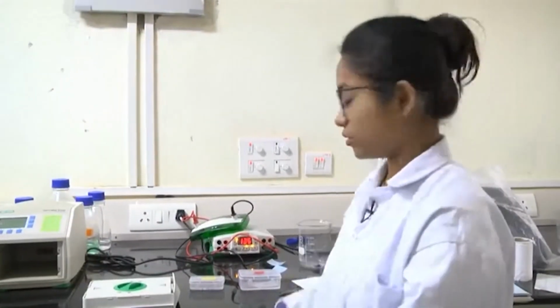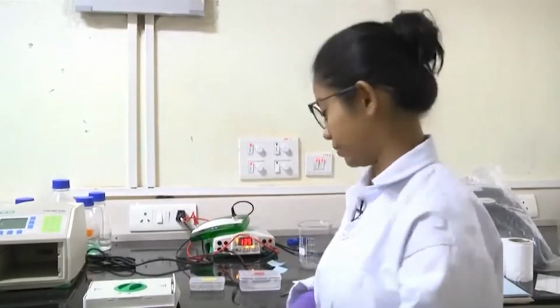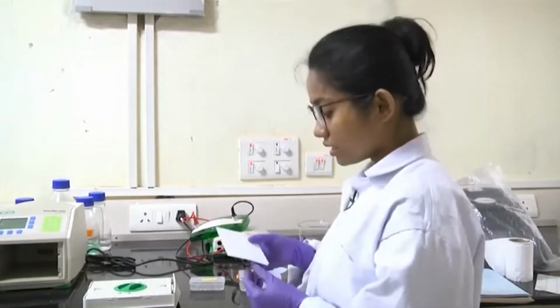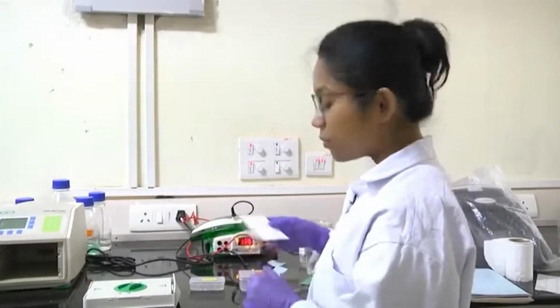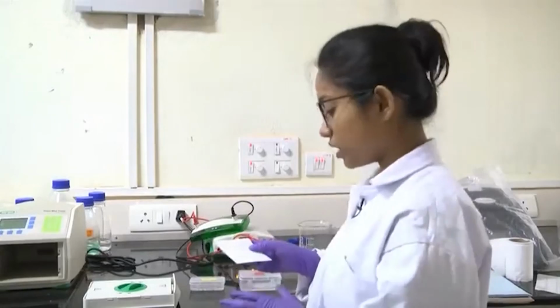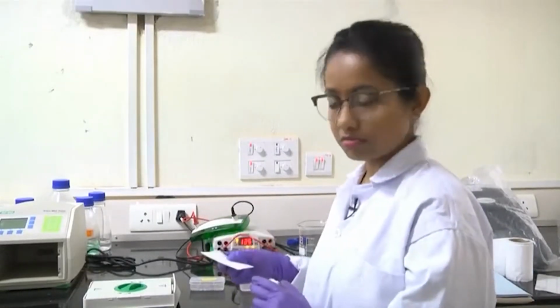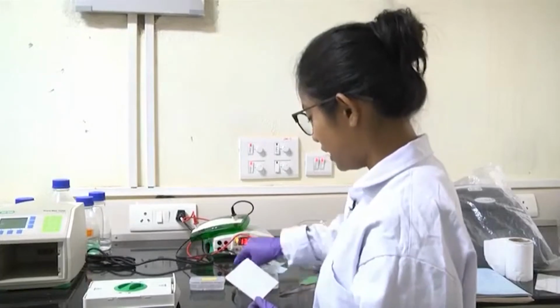Okay, so 15 minutes is over. Now our membrane and the gel are equilibrated enough in the transfer buffer. We also got this tissue paper, basically. These are blotting papers, and this is not normal general tissue paper. This is a high quality blotting paper, or Whatman blotting paper, and we will soak this blotting paper as well in the transfer buffer.